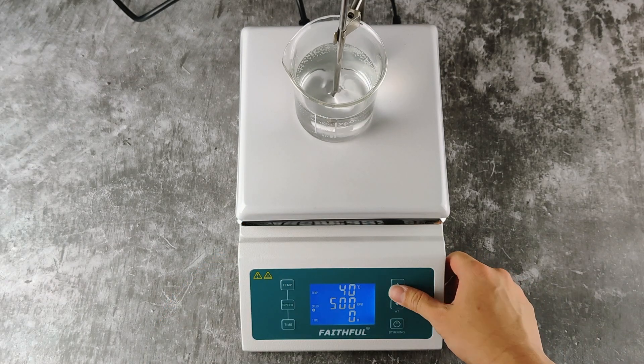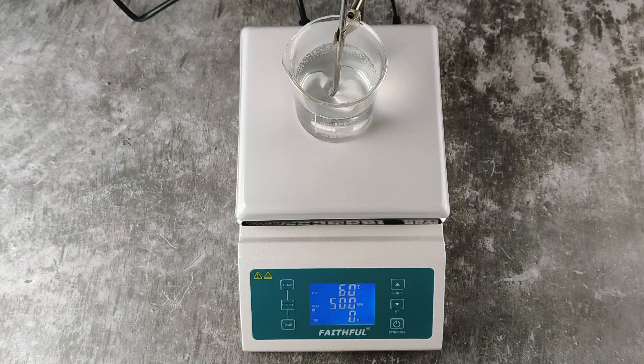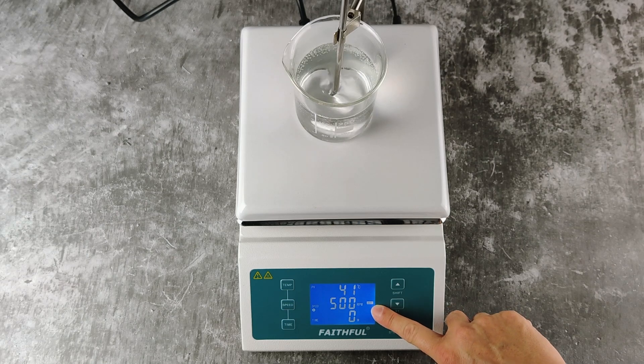Then, using the up and down arrow key, choose the temperature you desire. For this example, let's put it to 60 degrees. After that, press the temp button again. You can see the heat icon indicates that it's heating now.